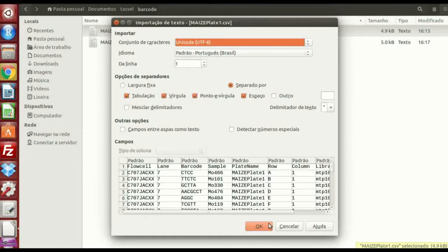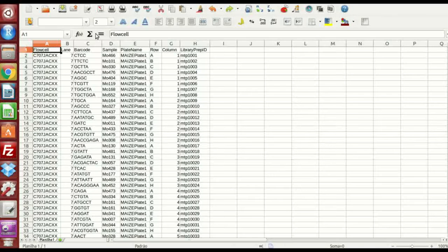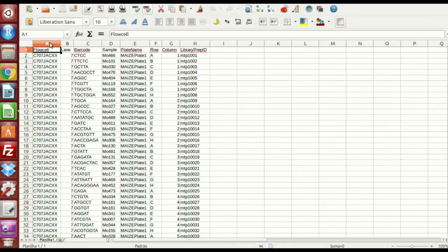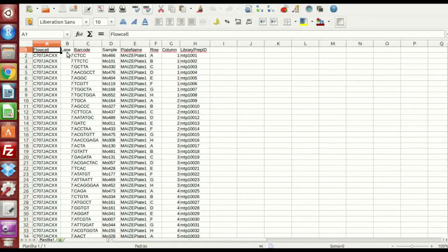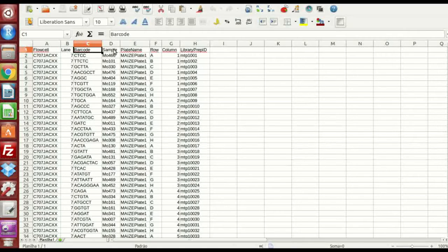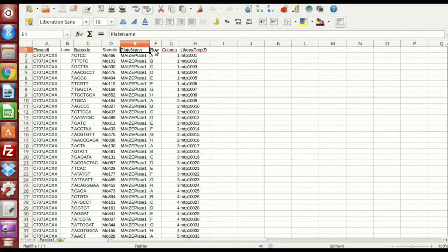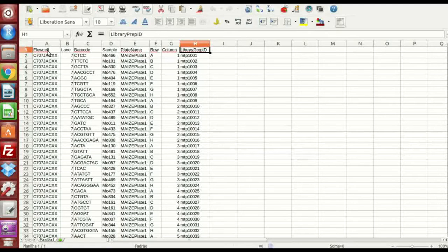In this file, you have these columns with the name flowcell, lane, barcodes, sample, plate name, row, column, and library prep ID.